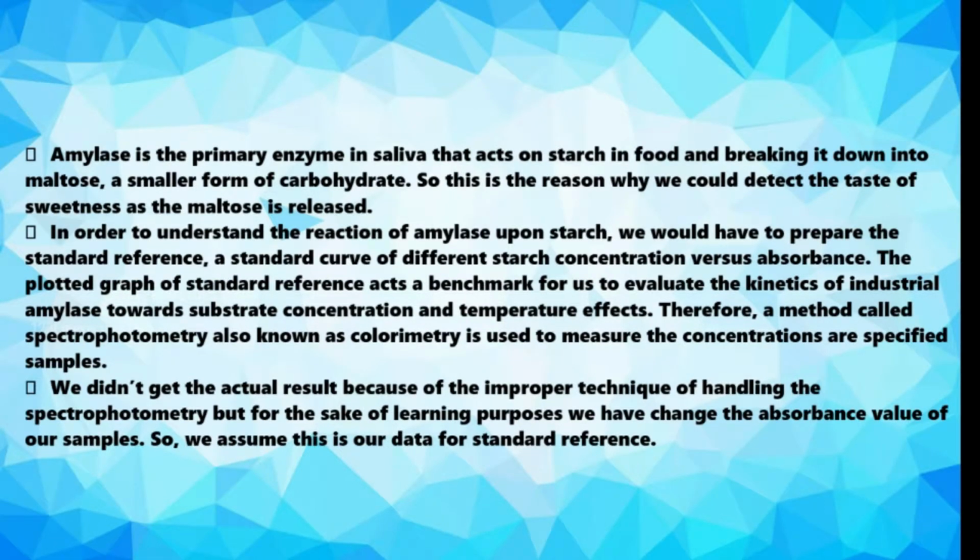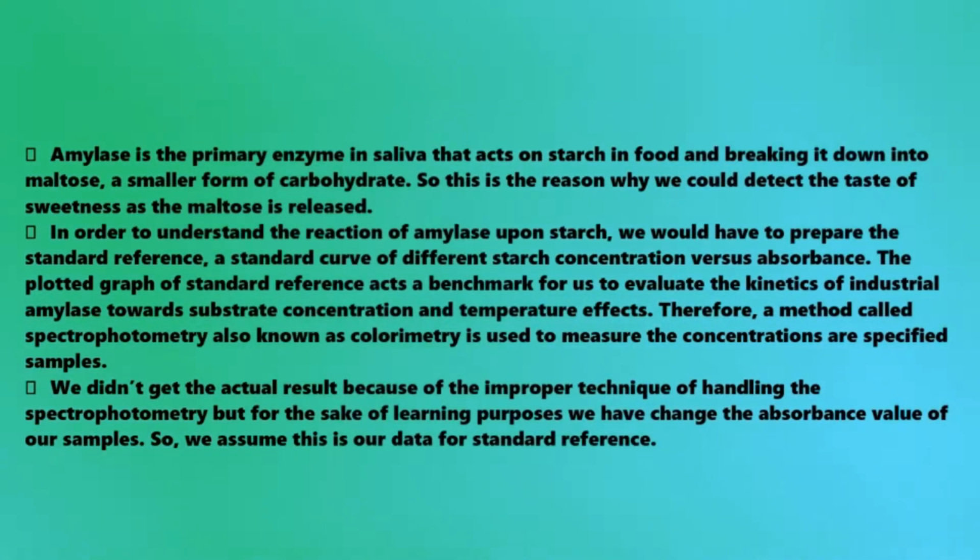We didn't get the actual result because of improper technique in handling the spectrophotometer, but for learning purposes we have changed the absorbance values of our samples. So, we assume this is our data for the standard reference.